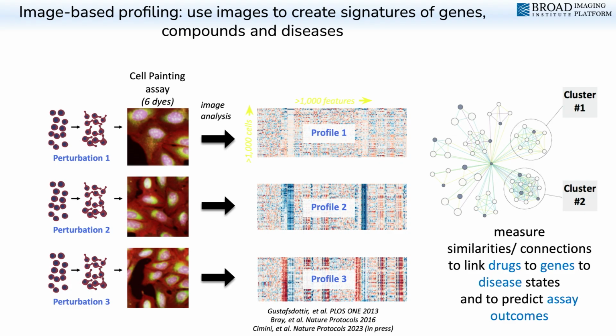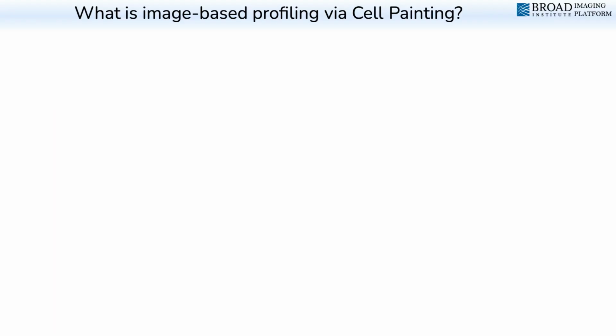So what you've done now is you've taken this chemical, which was just this chemical structure, you've treated some cells with it, and you've mapped that chemical now to this high-dimensional phenotypic space, high-dimensional visual space, which represents how the cells change in the presence of that chemical, all right? And it turns out that this trick almost allows you to now solve a lot of problems downstream in drug discovery, and I'll try to walk you through some of those, all right?